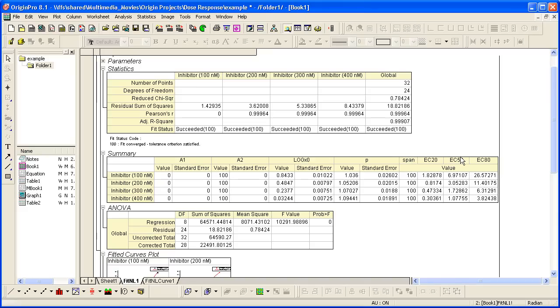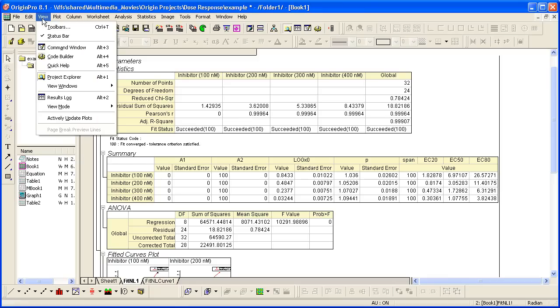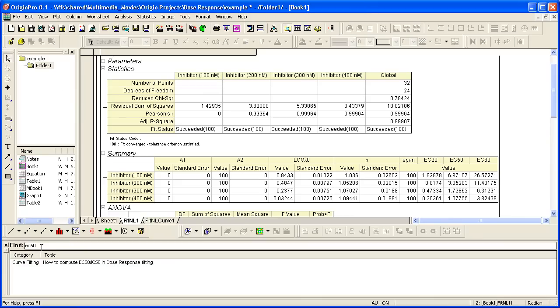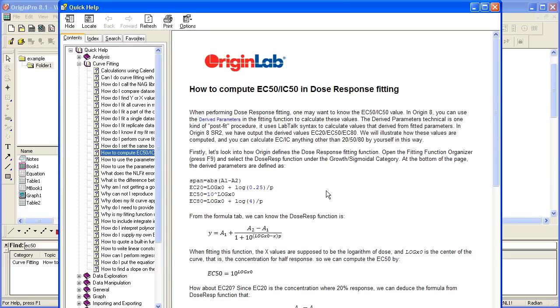These values are not fitted parameters, so they are derived parameters, meaning they're computed after fitting. Origin has a quick help item. If I click on View Quick Help to open the Quick Help window and type in the word, or the keyword, EC50, this will bring up an item here, showing you how to compute these values with instructions on how to generate more derived parameters.